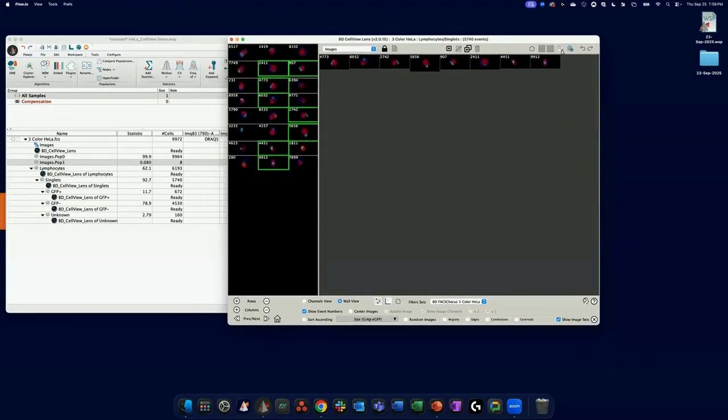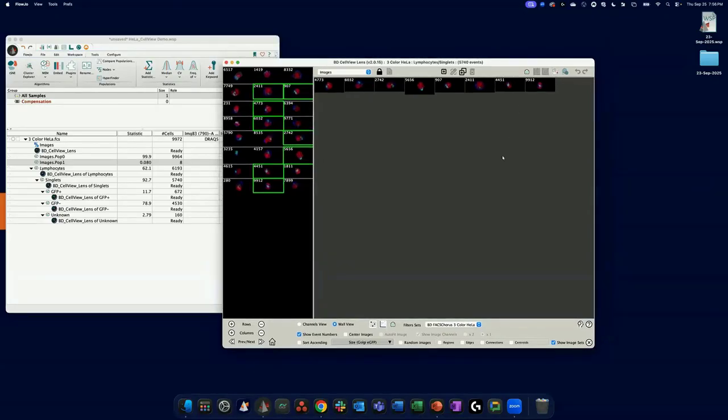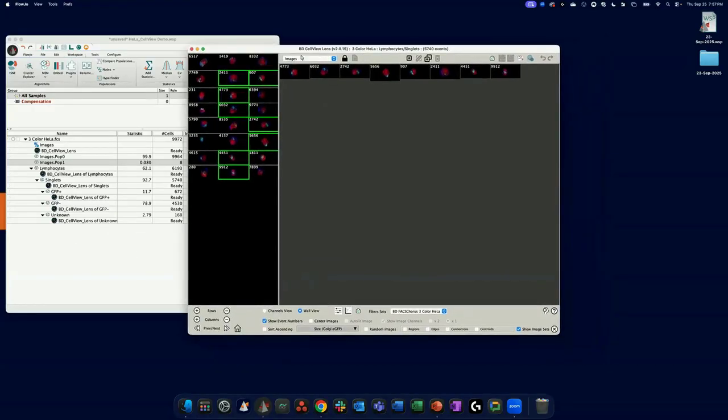There is also a nearest neighbor calculation as well, so a little bit of machine learning. So if you are building a set of images, maybe for a nice nuclear translocated signal, you could tell FlowJo, find me images and cells that look like these, and it'll have the same result, right? You'll have those 2 subpopulations, everything that was off target and on target.